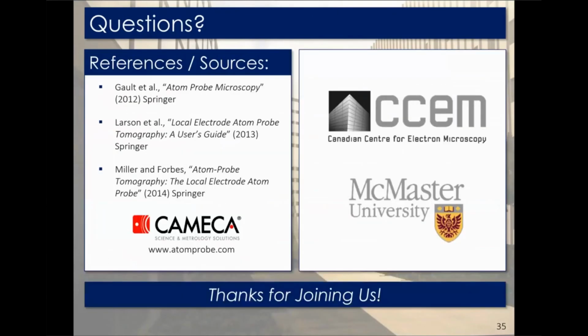And so finally, just before I'd like to switch out to the questions, I just want to highlight some references and sources I've used, as well as some images that I've grabbed for this talk. These are 3 texts that I have listed here. They're all very good, and they cover a lot when it comes to atom probe, and they also go in depth on a lot of topics, as well as having references to literature on their own. So I think they're all available online, if you can look at them through your institution. So I'd highly recommend checking them all out. Also, you can go to the Cameca website, which is the manufacturer of the local electrode atom probe, at atomprobe.com. They do have a lot of free resources available, so you can check that out as well.